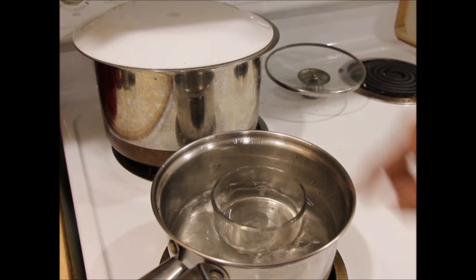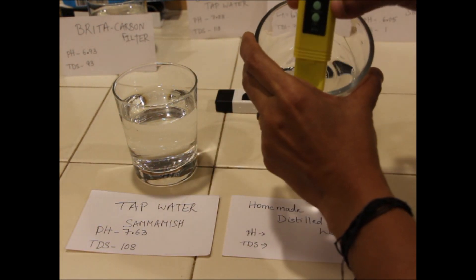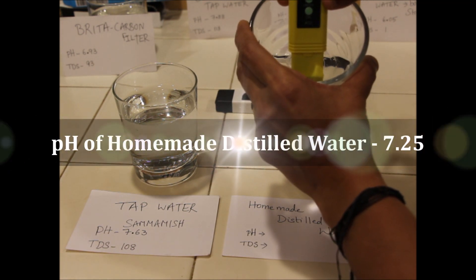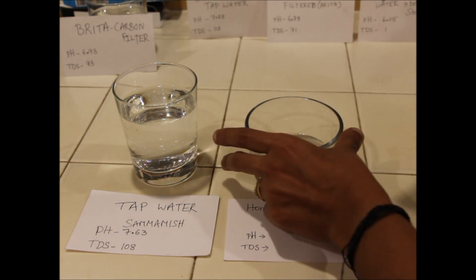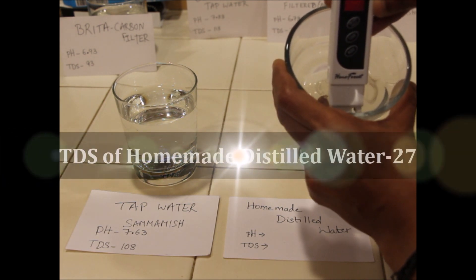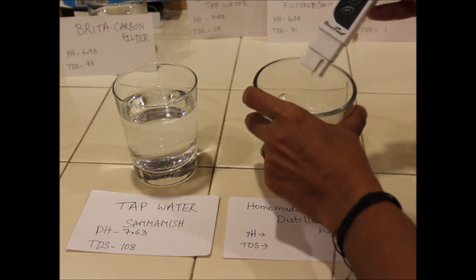I have some water collected in my small bowl. Now let us measure the pH and TDS values for this homemade distilled water. My homemade distilled water recorded a pH value of 7.25, and the TDS reads as 27. Ideally this should have been zero, but nevertheless it is under the safe drinking water limits.